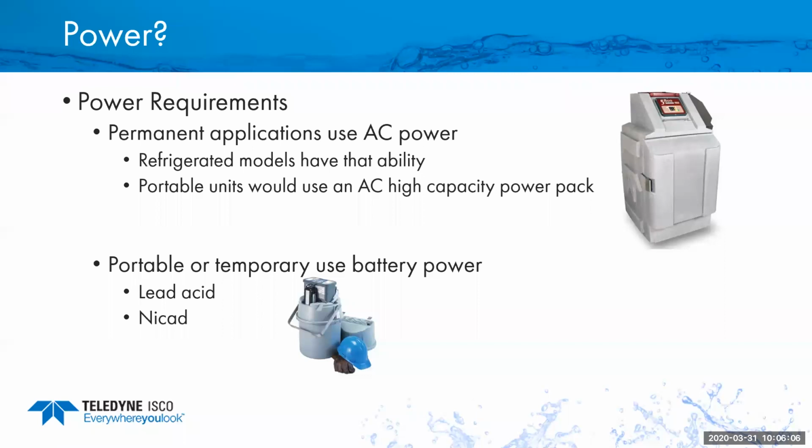Also, they're not quite as effective in cold weather either. If they're in cold weather, it's basically a lead acid battery, just like what's in your car. They just don't quite work as well. NiCads, on the other hand, perform better in cold weather.